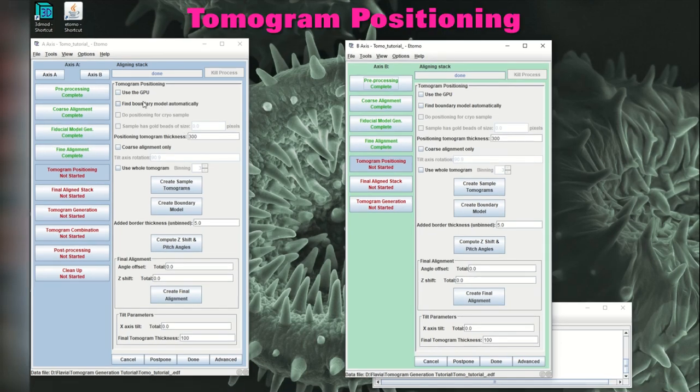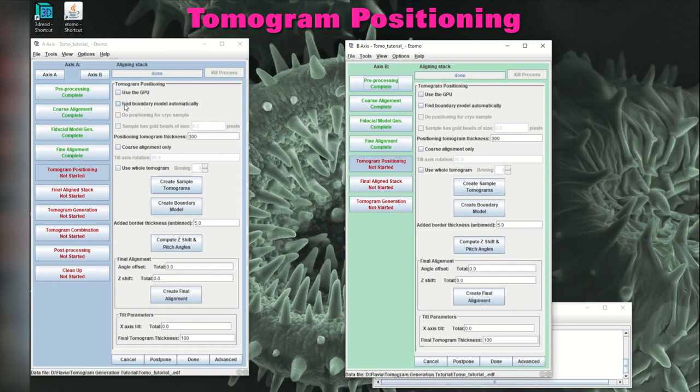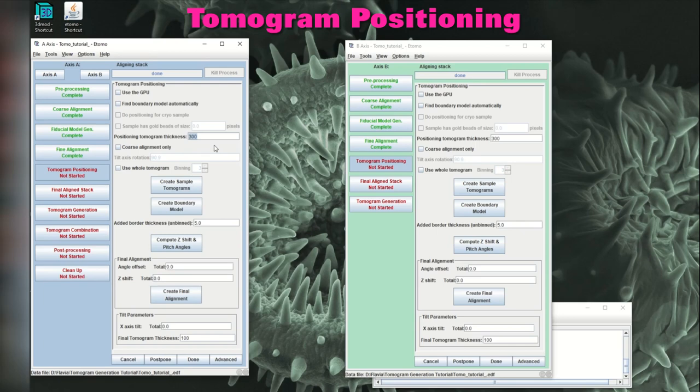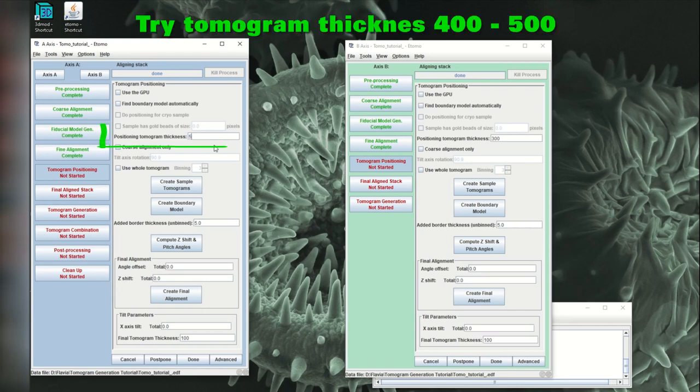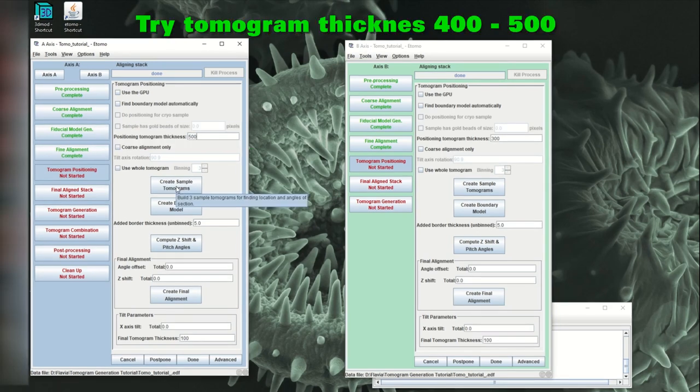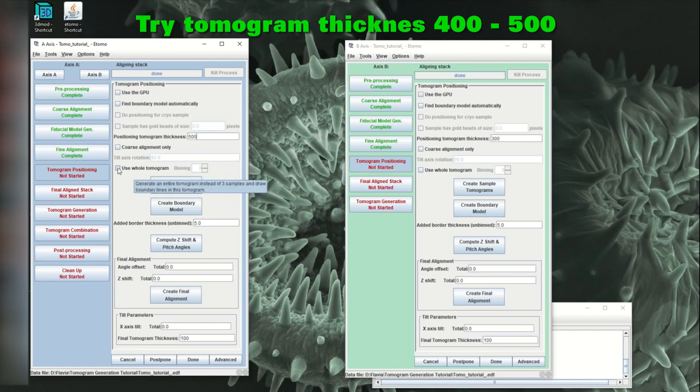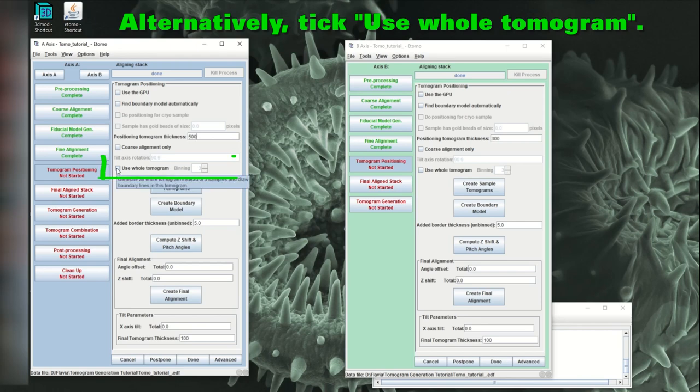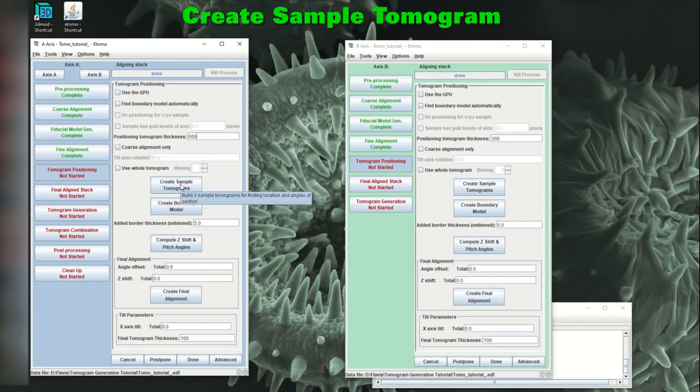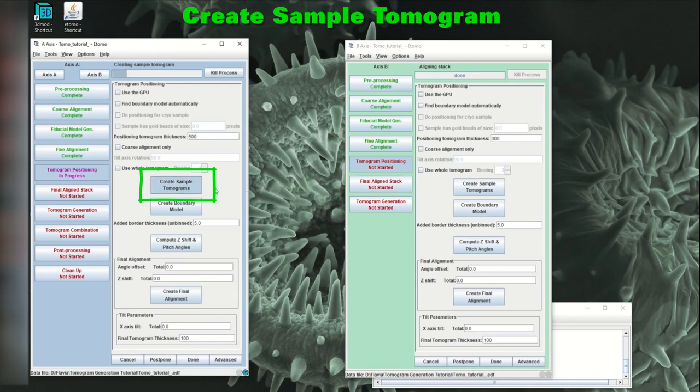So when it comes to the create sample tomogram window, then you can find the boundary model automatically. Although I haven't got a lot of experience with this one, I heard that it doesn't work terribly well. What I usually do is I create a sample tomogram of a thickness of about 400 to 500. It really depends on how straight your tomogram is and you'll see what I mean in a minute. But if you go for something like 500, let's see if we can find our tomogram within this region. If your tomogram is not fully within this region, you can click on use whole tomogram. And then you'll definitely find it so that you can create the sample tomograms, make a boundary model.